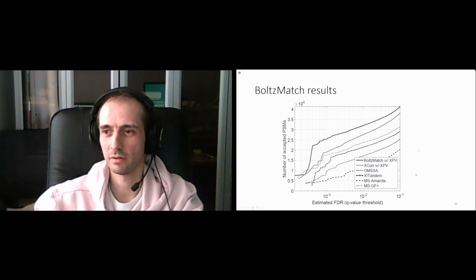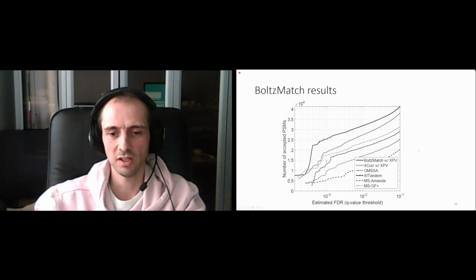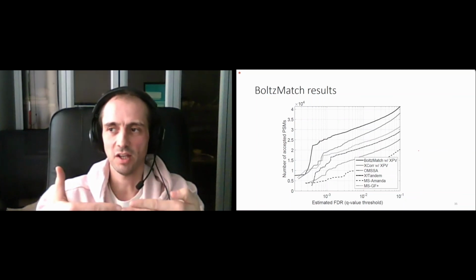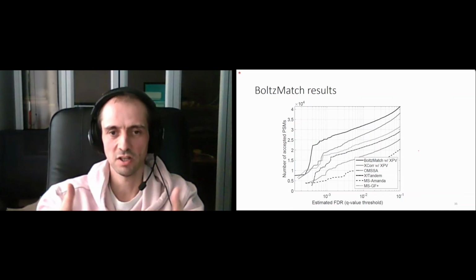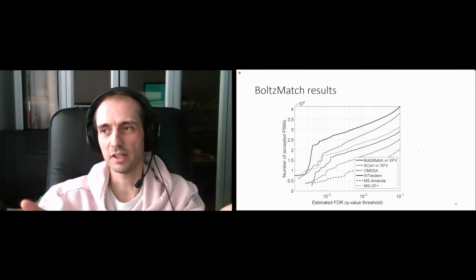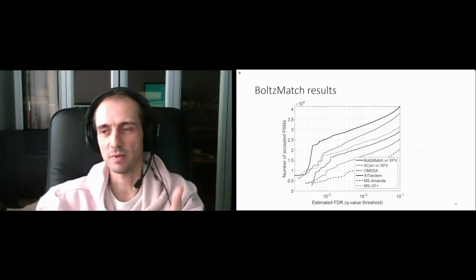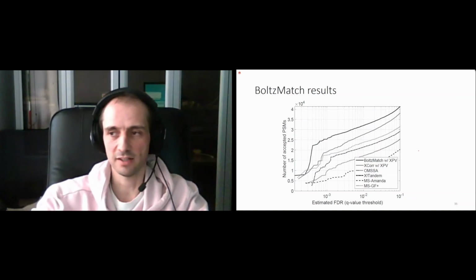Okay. And that's because you need to adapt the bin sizes. So most of the time, more or less, the fragmentation is the same for each instrument. Yeah. But there are some instrumentation technologies, which fail to observe the Y ion series. Okay, then you will get more B ions, and then this kind of types. But on another instrument, if you choose the wrong instrument for your method, then you will not get anything better.